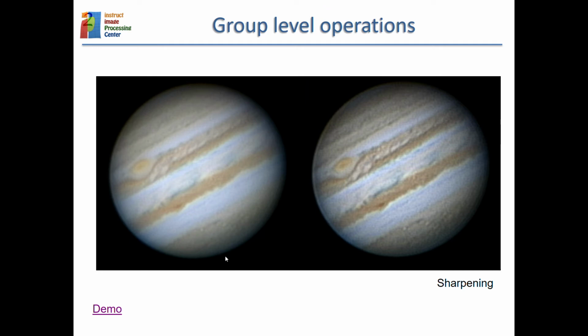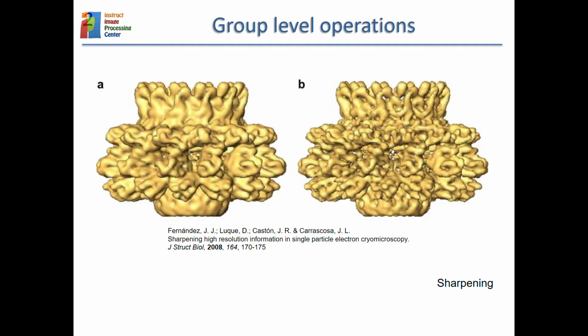These edge detections are also part of some of the operations that we do in cryo-EM. And here, for instance, is the sharpening that we do at the end, just to highlight the high frequency components.